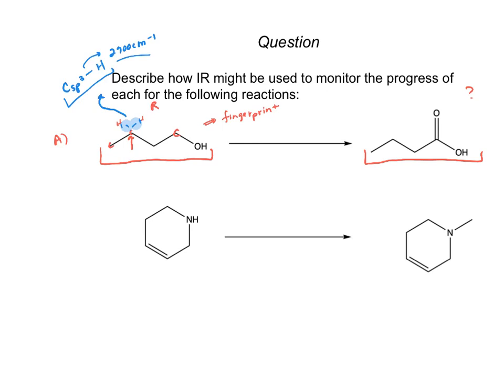The other thing that we will expect in the diagnostic region is this oxygen-hydrogen bond. So again, we're looking at the stretching from this bond. Oxygen-hydrogen we can expect to find at about 36. But as a reminder, with respect to the overall shape for this bond, we should expect a broad signal between about 32 and 3600.